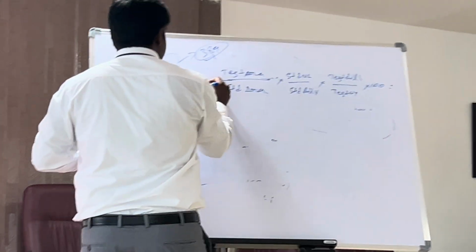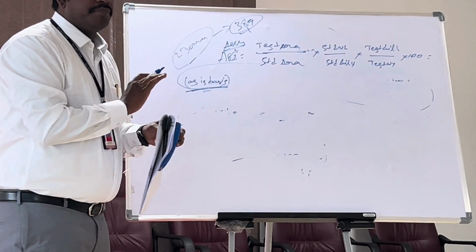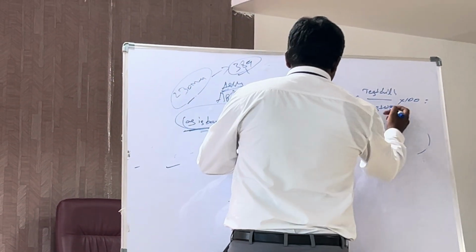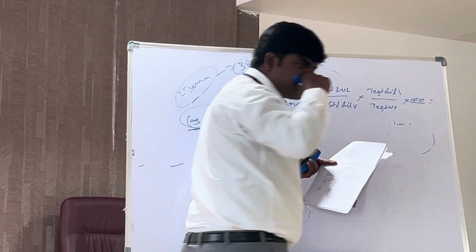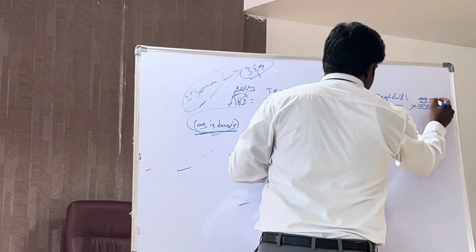Whether it is API, the assay calculation will be like this. If it is API, it is simple. You don't need to do anything. Simply you need to mention the potency here directly, or if your potency correction is required, then you can apply 99.5 if there is a potency.